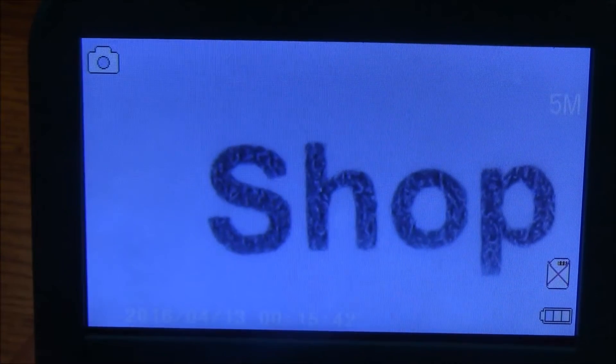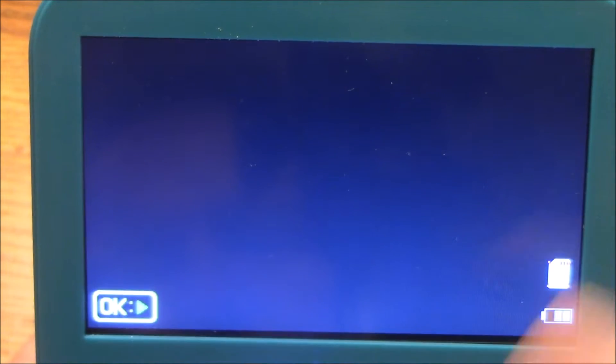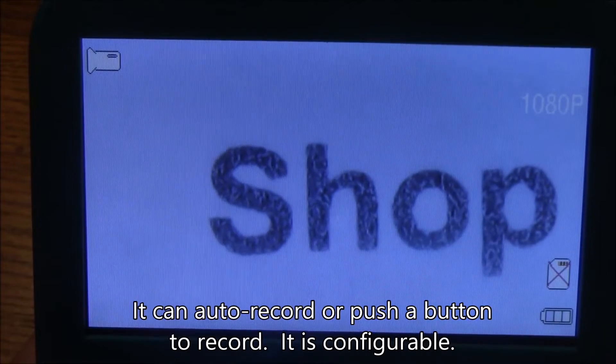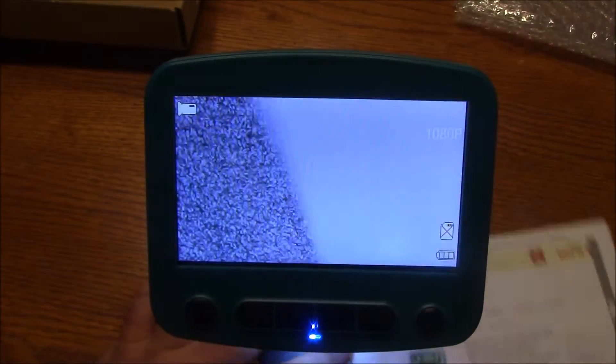There's also a mode where it flips over and shows you the date, and I think you can take pictures with this if you have your SD card in. Hit it again, it goes back into the playback mode. If I had an SD card, it would be able to play back some of the videos, and I think as soon as you turn it on, it starts recording. Hit the mode again, it goes back to the normal screen.